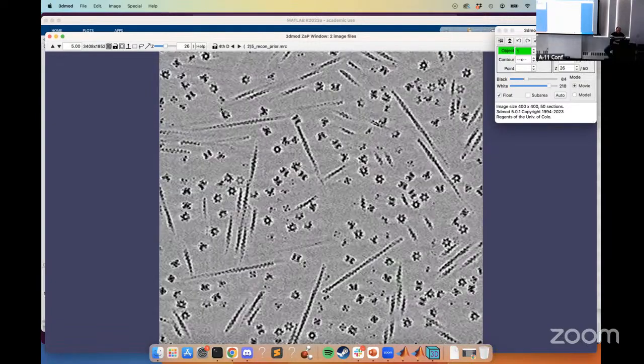But you can do other things. For instance, I gave it no defocus here, but in reality, your data has some defocus. If you match your defocus, or even just leave a little bit of defocus in the ground truth, like half a micron, some people prefer that. It seems like less of a stretch. So you can pick and choose ground truth however you see fit.